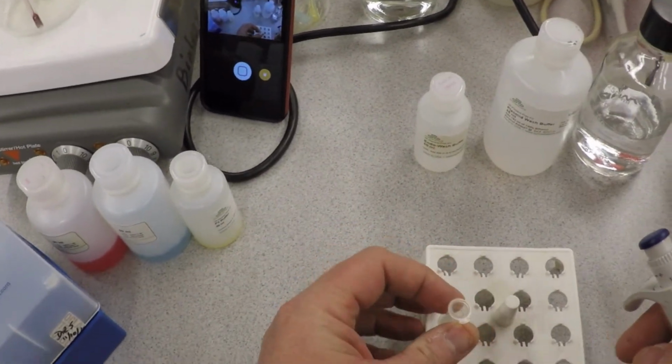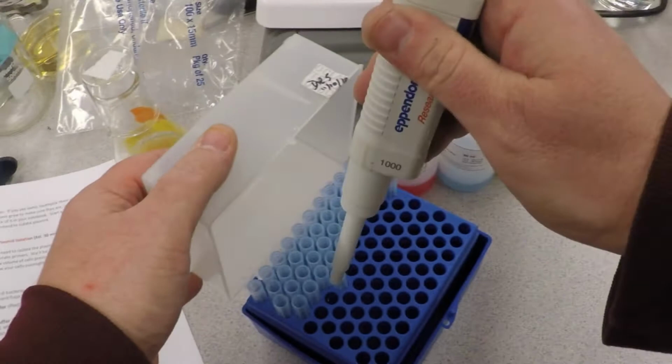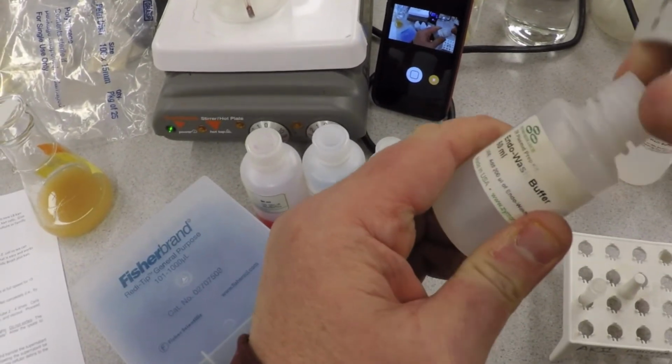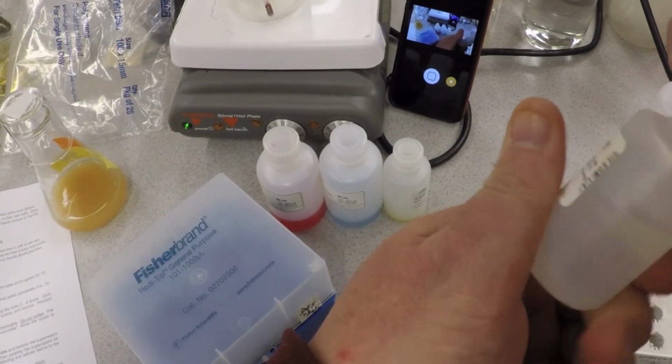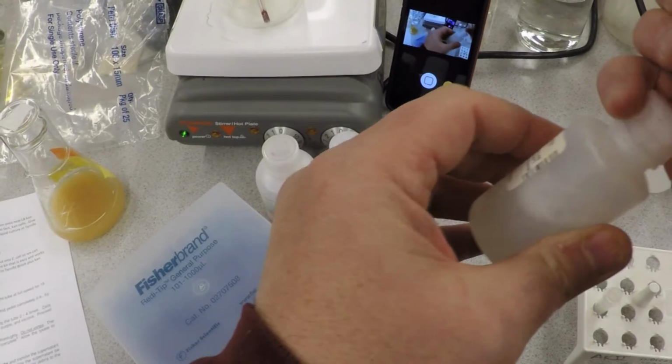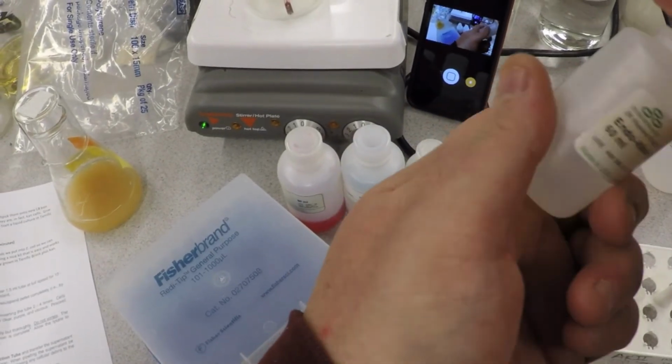So I stick this back in there again. Take my Endo wash buffer. Maybe shake it up a little bit. I don't know how long this has been sitting. You can see it's got detergent in it.